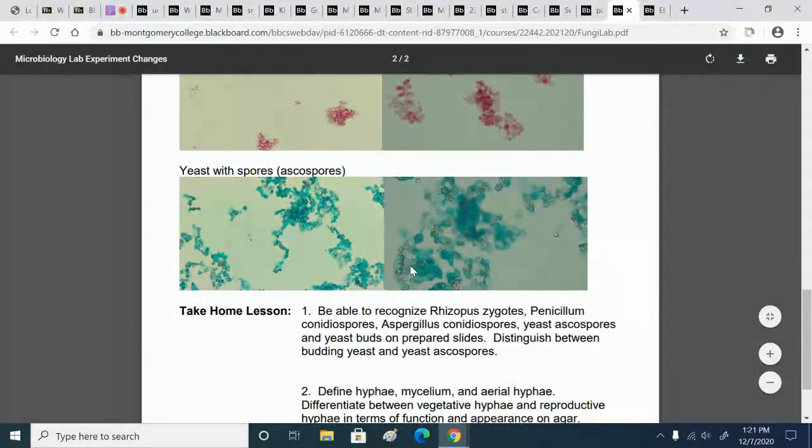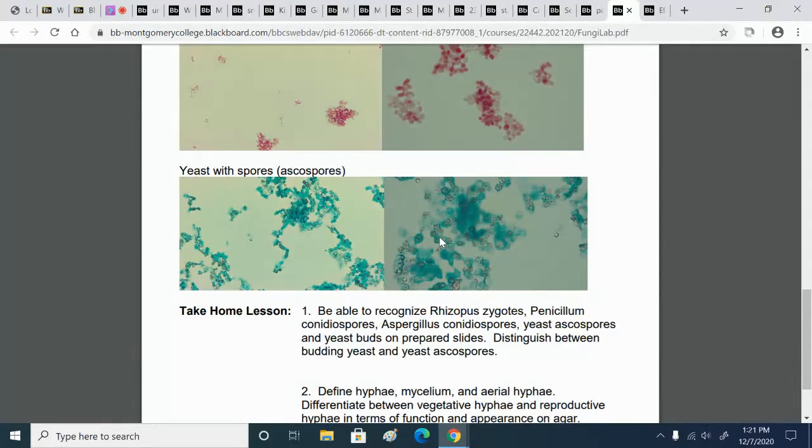And you can see in this image, they look kind of black, but they're usually stained a real dark red color, so they almost look black. And those are the spores inside of the green yeast cells. So when conditions are not favorable, fungi will get together, exchange genes, and produce spores or offspring that hopefully are better adapted to survive.